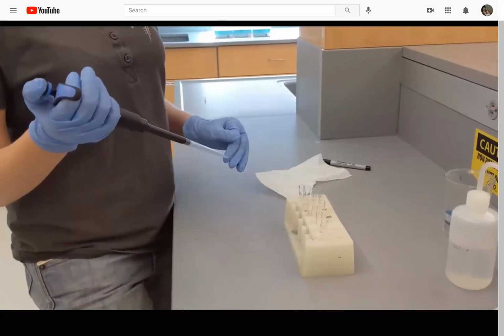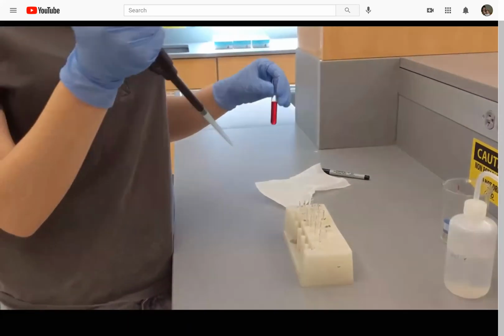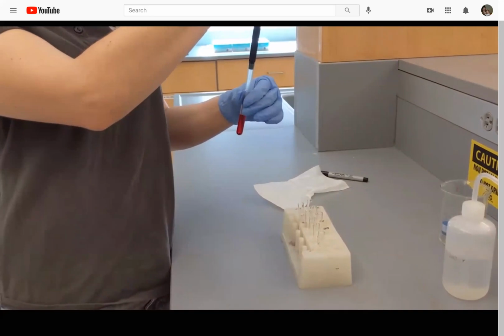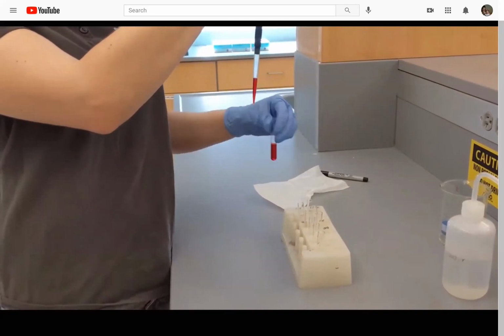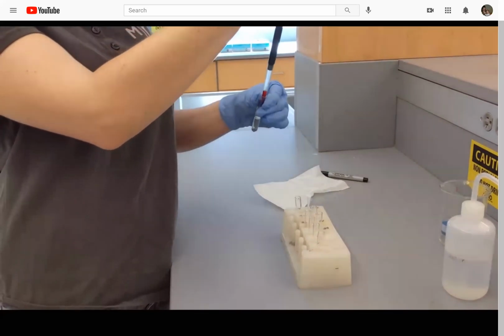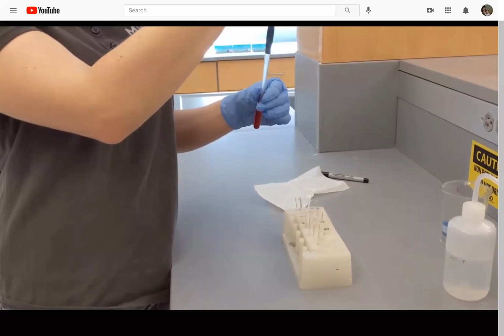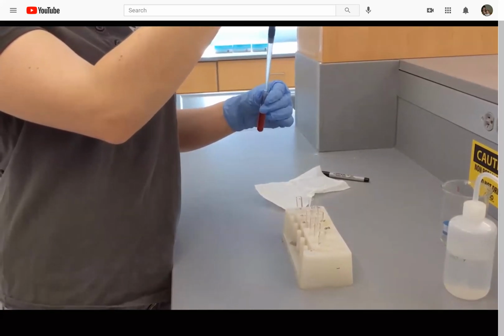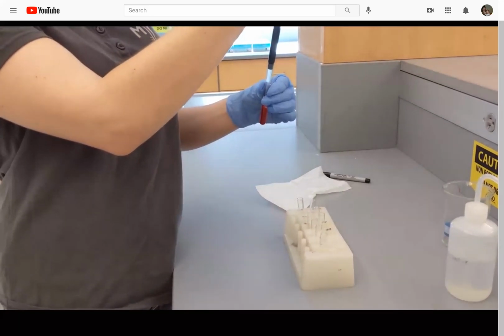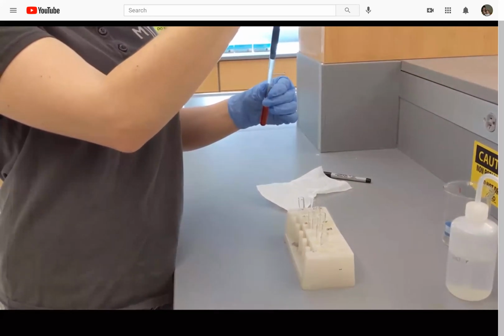So I'm now going to add 500 microliters of my standard solution to my next test tube. For the sake of mixing, I'm also going to draw some of the liquid up and dispense it back in.